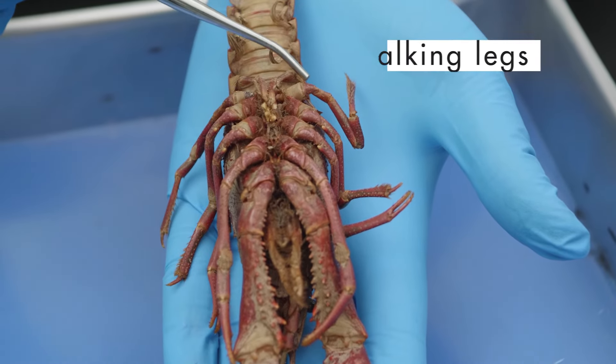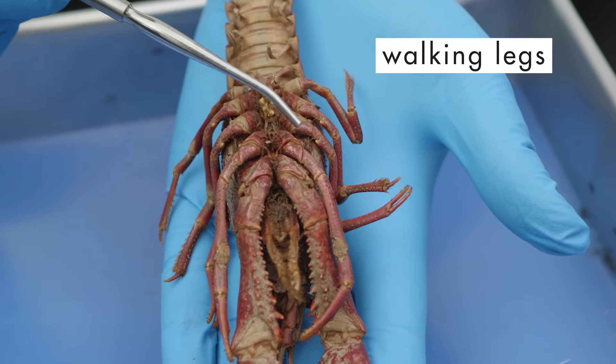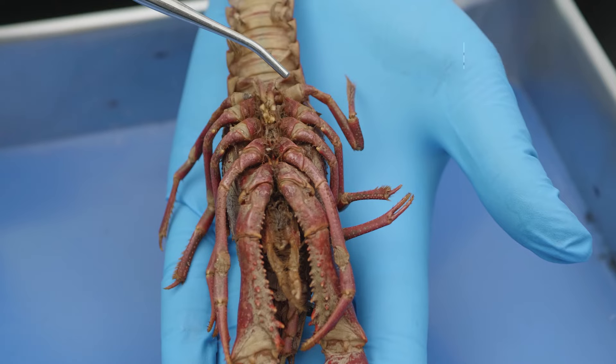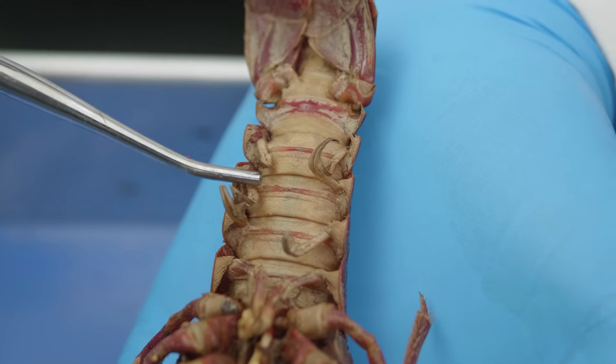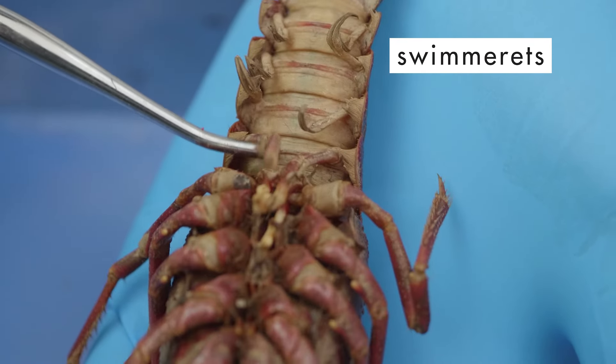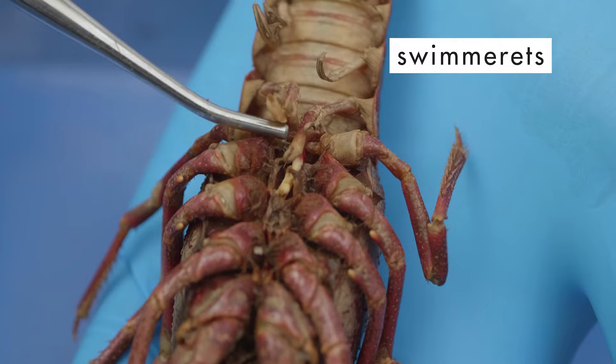The crayfish has four pairs of walking legs located along the side of the cephalothorax. Along the ventral side of the abdomen are several pairs of jointed appendages called swimmerets, which aid in swimming and in reproduction.